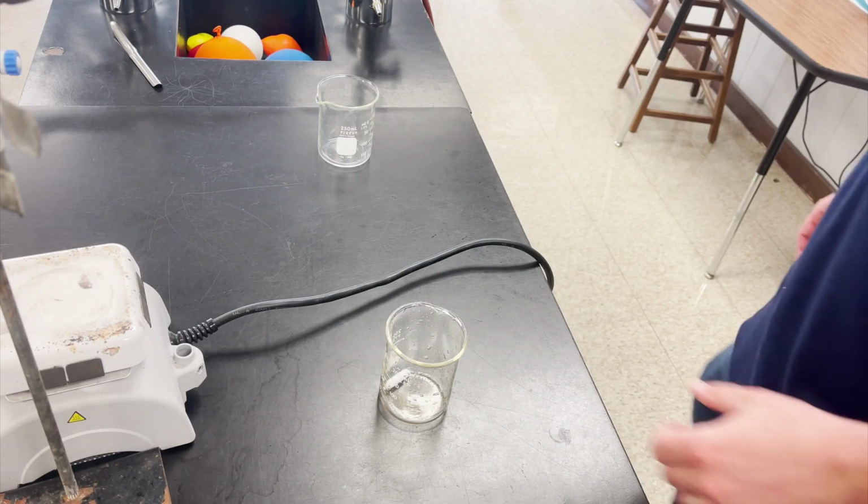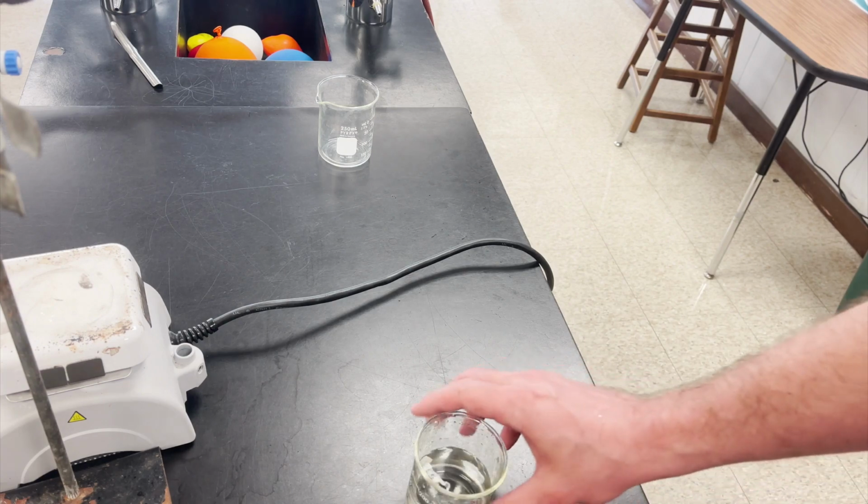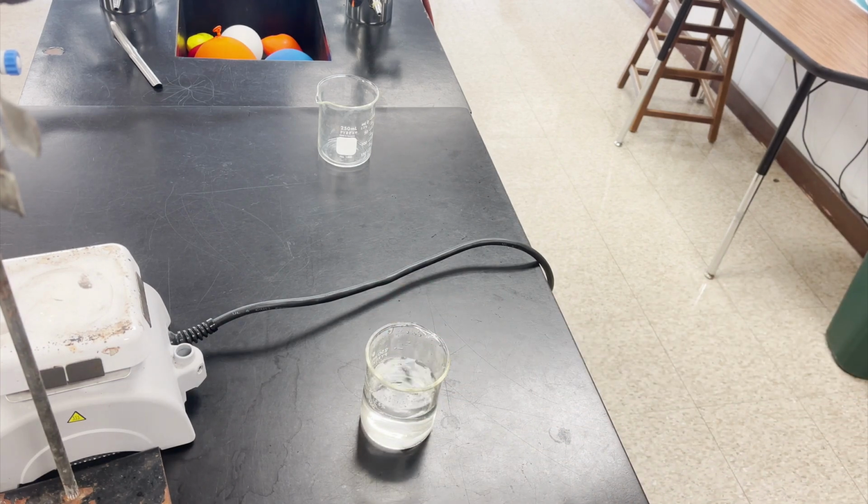All right, so what we're going to do here is put some water in this. And notice that I'm not being very precise with how much water I'm putting in there. I'm just putting in some amount of water. I point that out because I'm going to ask a question later about that.